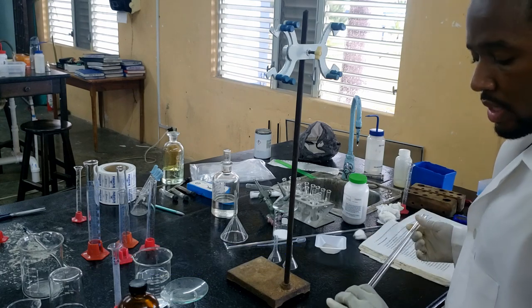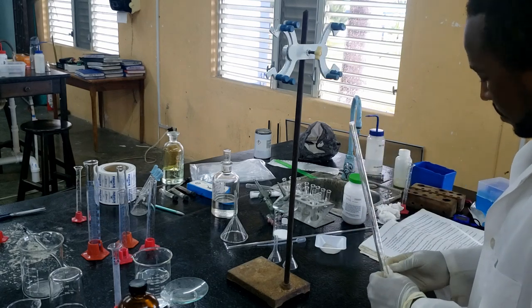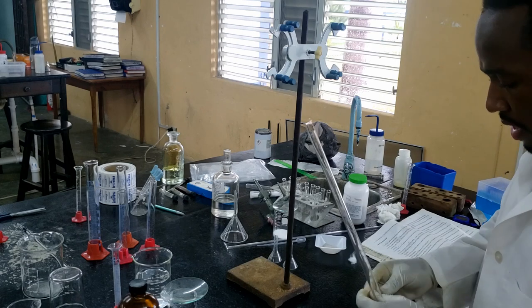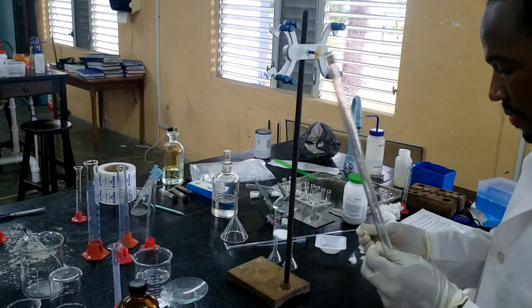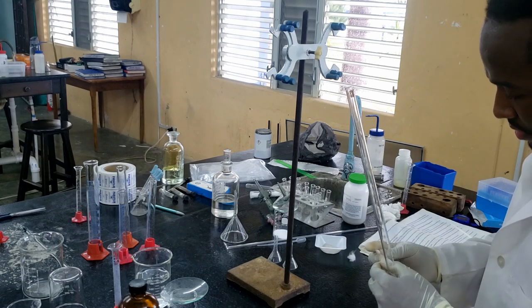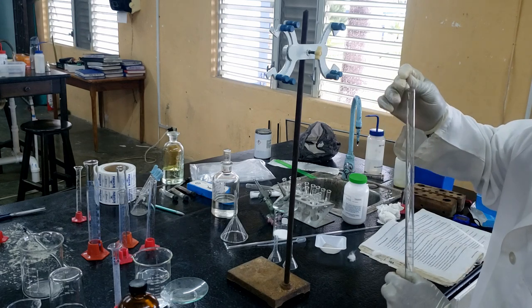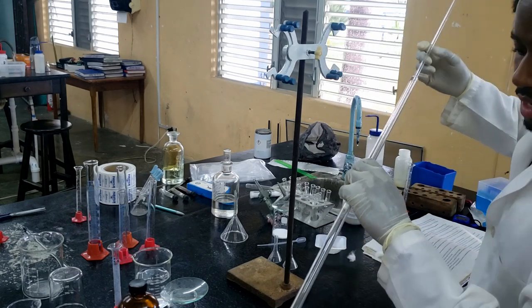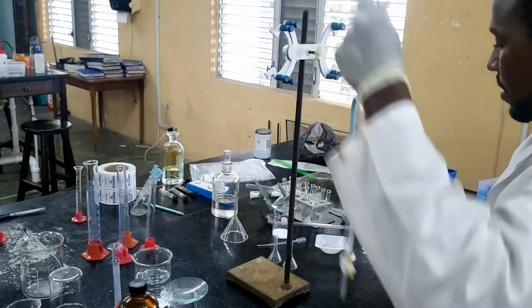We're now ready to start the column chromatography section of the lab. So first thing we need is our burette. Once we have our retort stand and our burette clamp set up, we're going to get a small piece of cotton. Roll it into a ball. And we're going to take one of the long glass rods and push that cotton ball down into the narrowing piece of the neck of the burette.